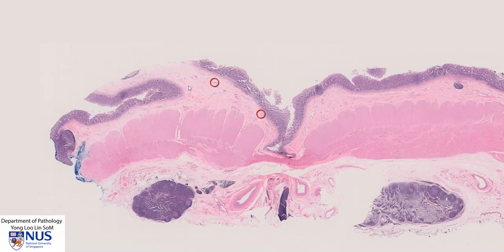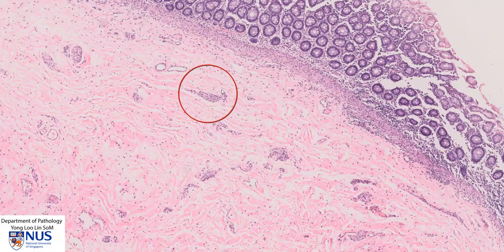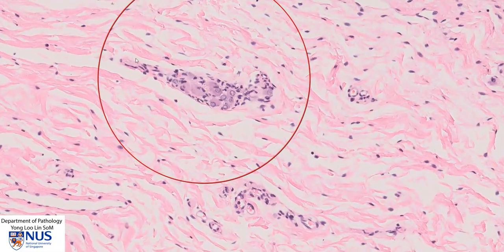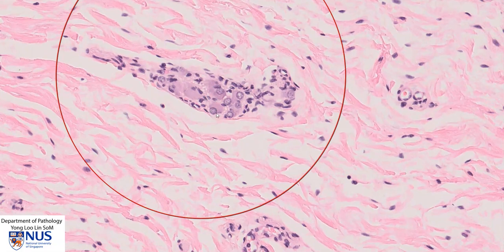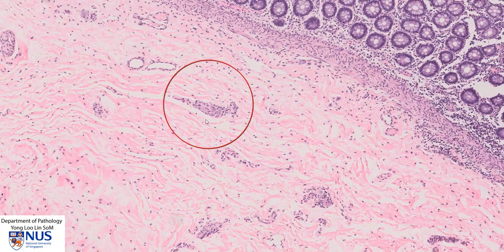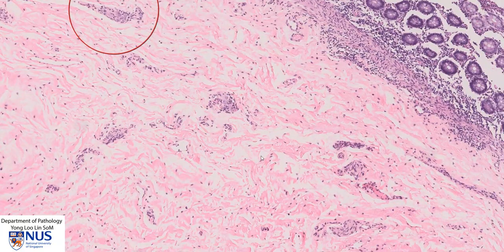Let's first look at the normal proximal segment and focus on the submucosal nerve plexus. We can see here a small nerve twig with some of these larger polygonal cells. These cells have eccentric, very round, large nuclei, and some of the nuclei contain a small but prominent nucleolus. These cells also have very abundant amphophilic cytoplasm — amphophilic means somewhere between pink and blue, so a little bit pale purplish. These are what ganglion cells look like, and we would expect to see them in both the submucosal as well as the myenteric nerve plexuses.